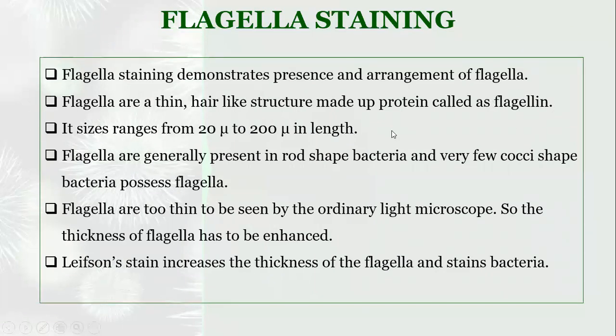The length of the flagella ranges from 20 to 200 micrometers, and it is a very thin structure which cannot be visualized with a light microscope, only with an electron microscope. So flagella staining needs a dye which enhances the thickness of the flagella.